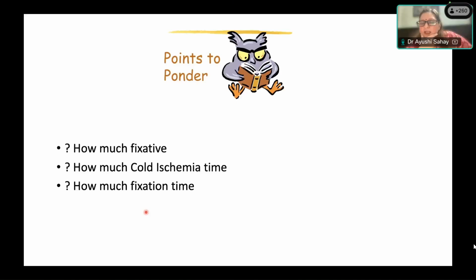So actually, that is a problem: we say that it is ideal, but it is not practically followed. It is easy for smaller biopsies to have containers in which you have 10 times the volume of fixative, but the majority of the time, the specimen is just lying in a jar with hardly anything. It is covering, taking up the whole space. It is stuffed into a small bag or a container or jar and just sent to the path lab.